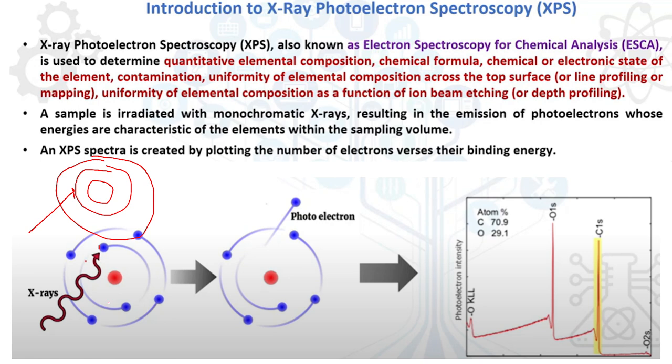In case of UV also, for example, if there is a presence of oxygen and a pi electron, and that oxygen lone pair is engaged with another metal or interacting with another element, then that n to pi star transition will change. Similarly, here also the binding energy will change. But FTIR is not that authentic. For example, if you mix A and B, obviously you will get a different peak. You cannot assure 100% whether a chemical bond or covalent bond is forming or not.